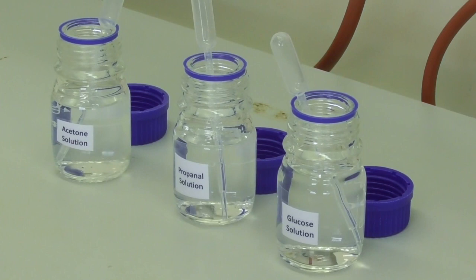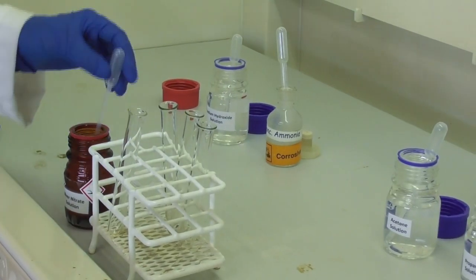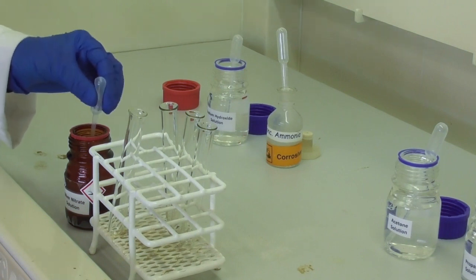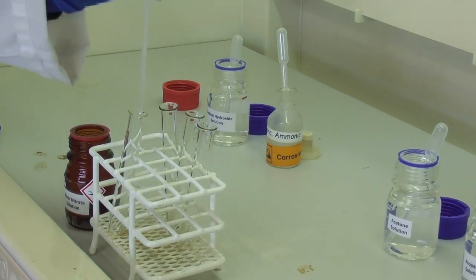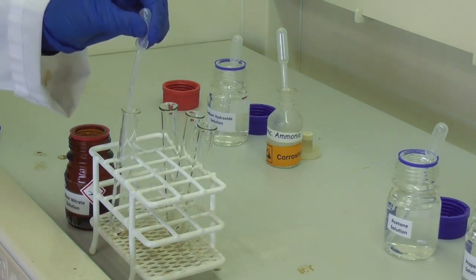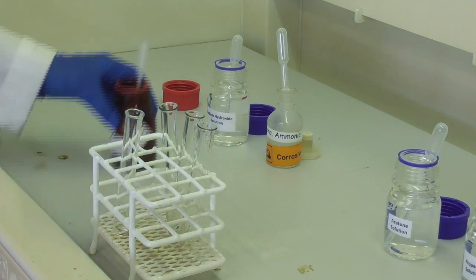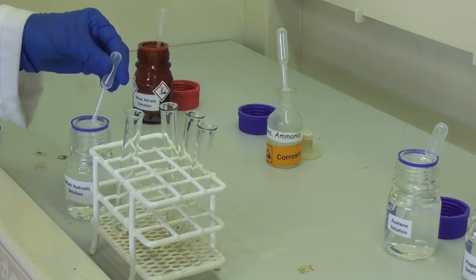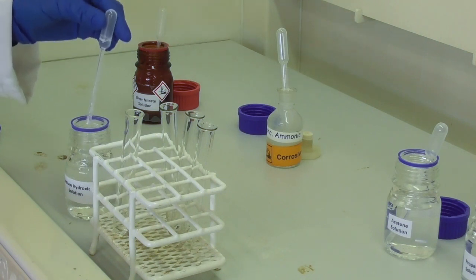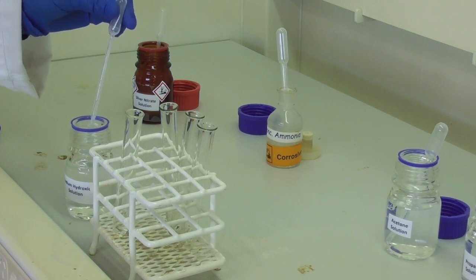All the reagents for the Tollens test are set up in the fume hood. We begin by adding one milliliter of silver nitrate into a test tube. Next we add one milliliter of sodium hydroxide solution into the same test tube.